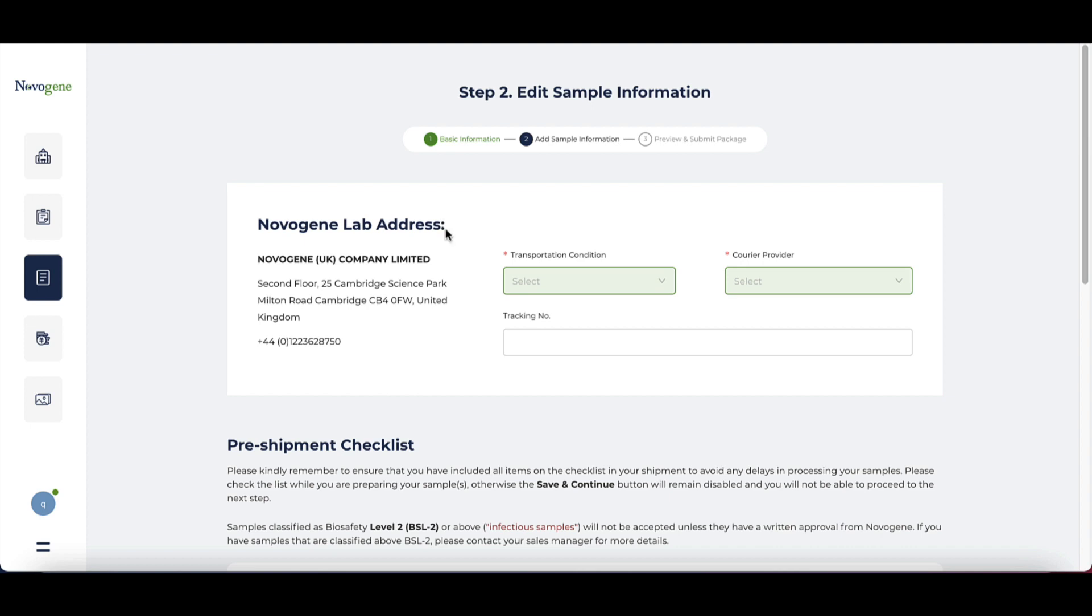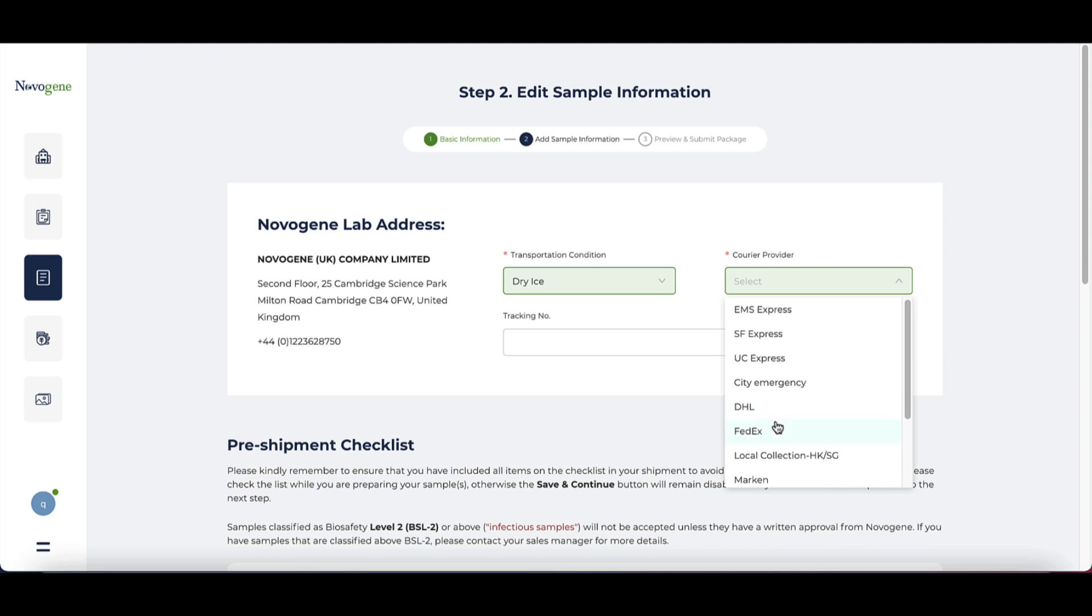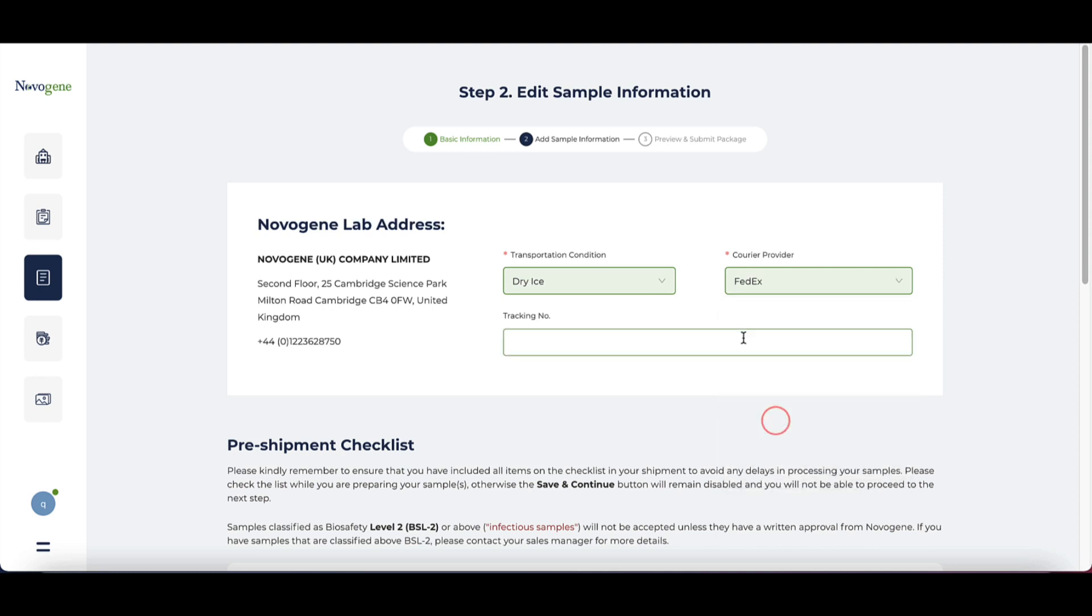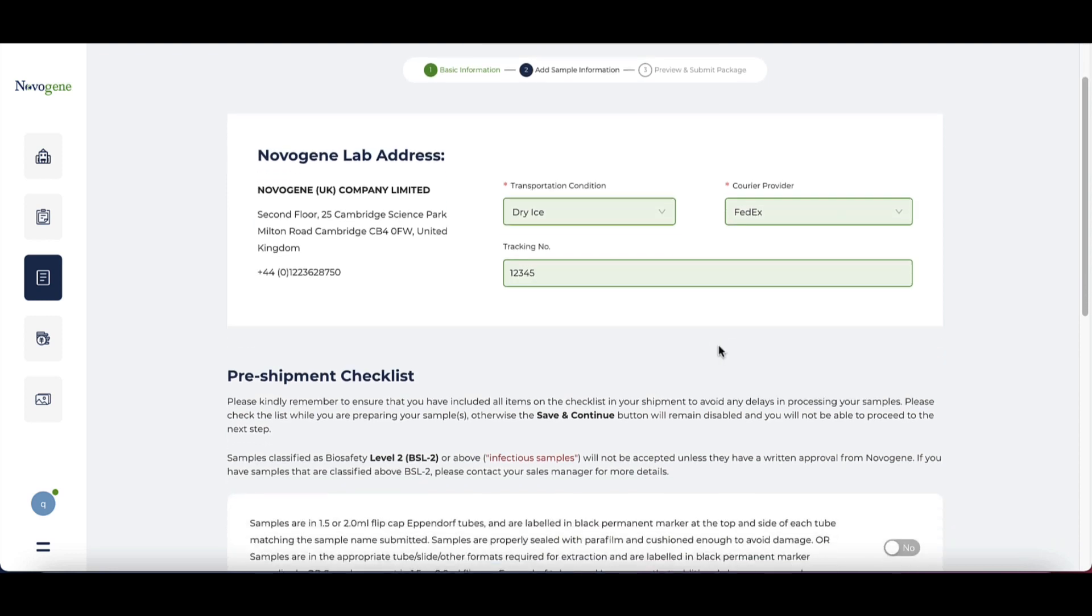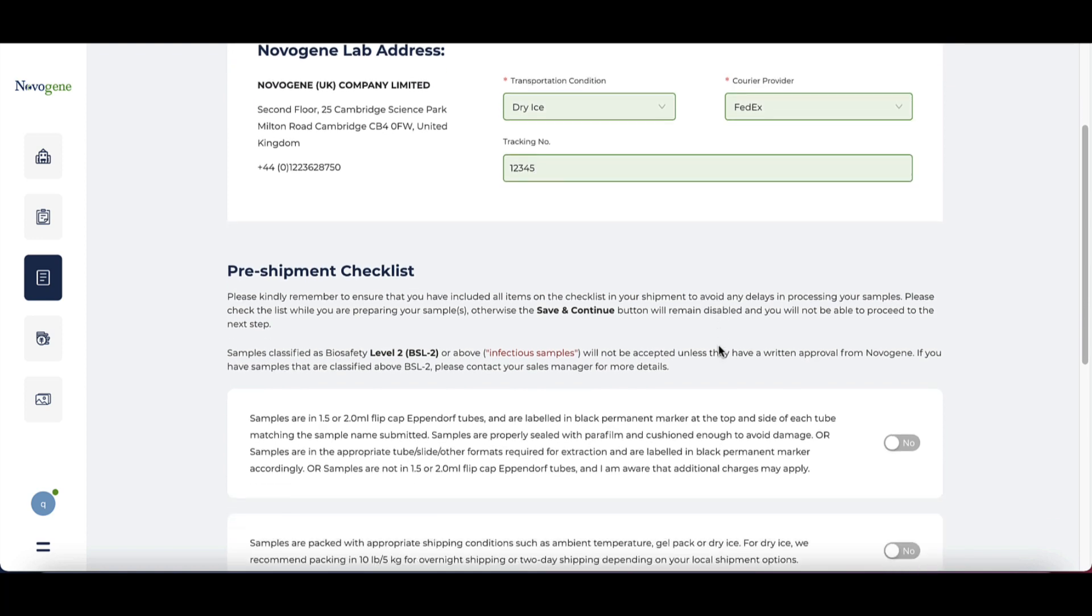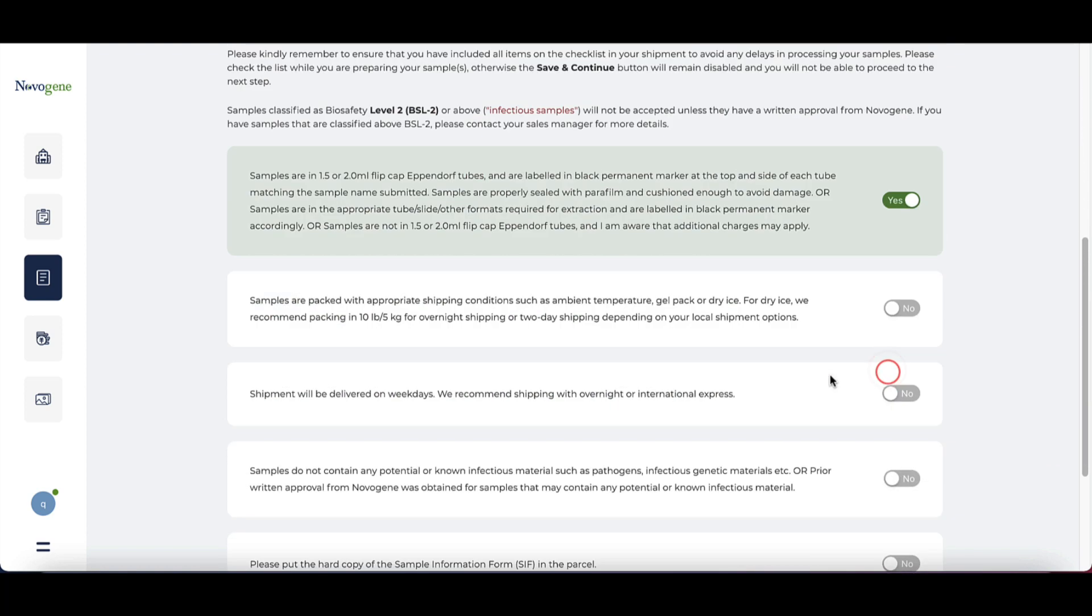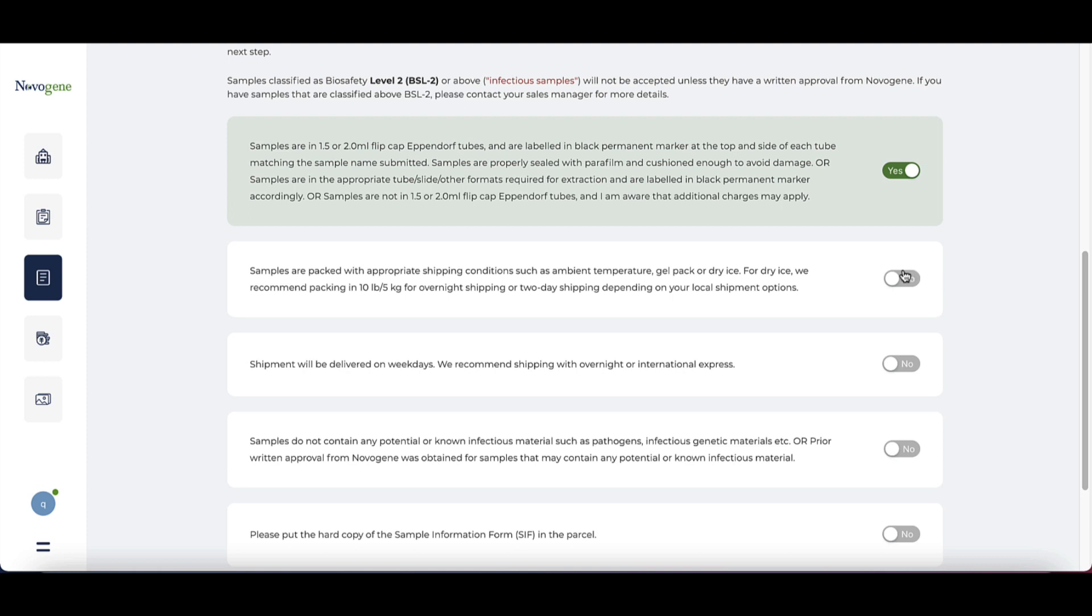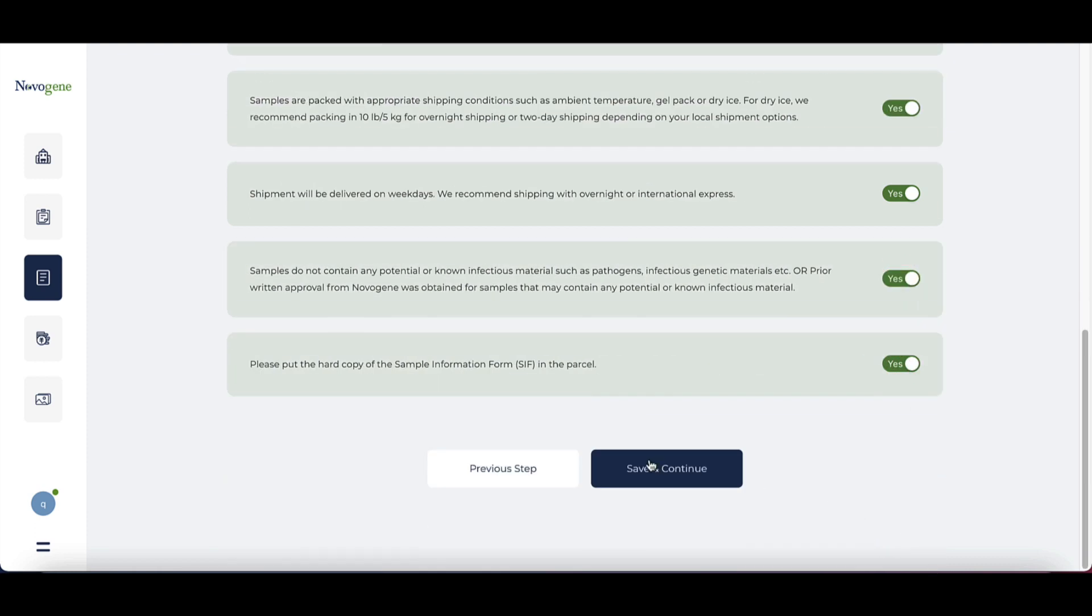The next page is about the shipping information. Please select the transportation condition and the courier provider on this page. It will be helpful if you could fill in the tracking number on this page. This could help the sample collection team record the samples to the system quickly once they arrive. Please read and confirm the shipment checklist. It is very important to make sure your sample and project can be handled safely.